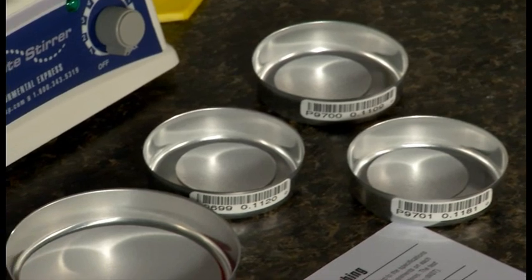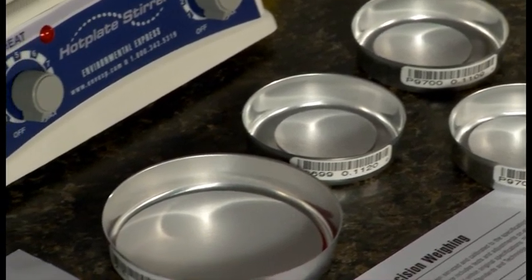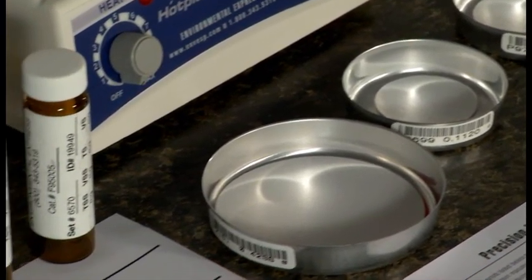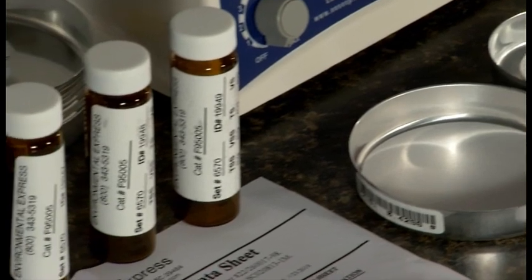Each filter is washed, dried, desiccated, and weighed. Half the test has been done for the analyst by the time it reaches the laboratory.